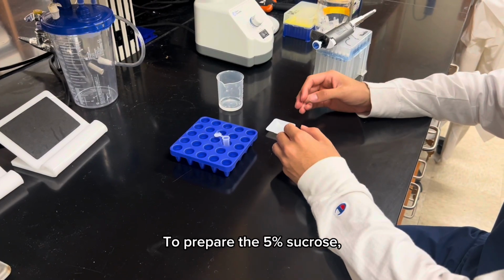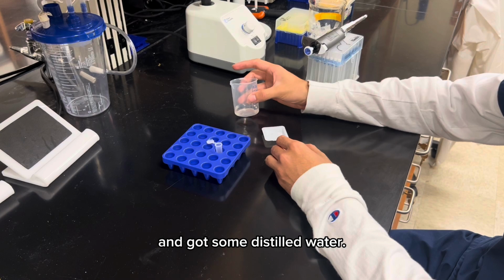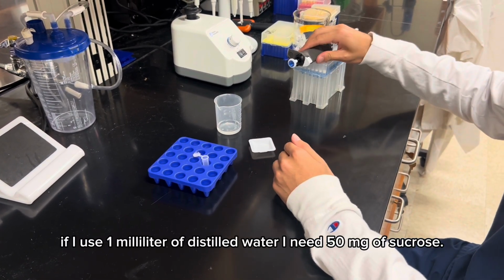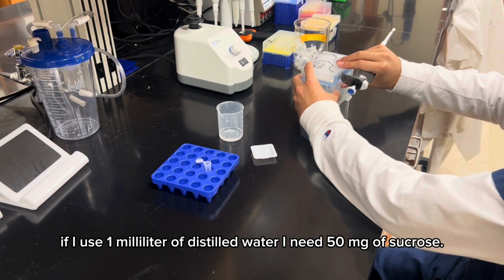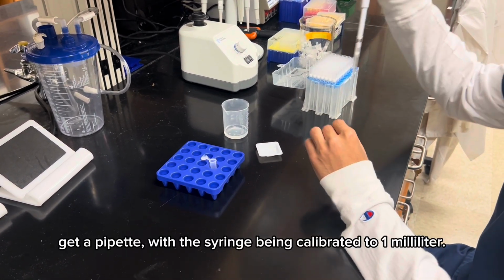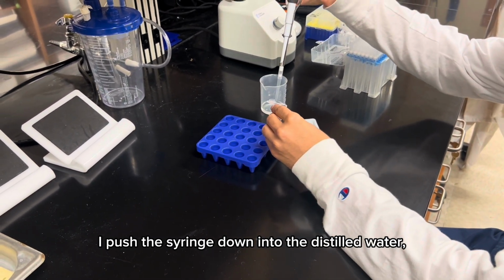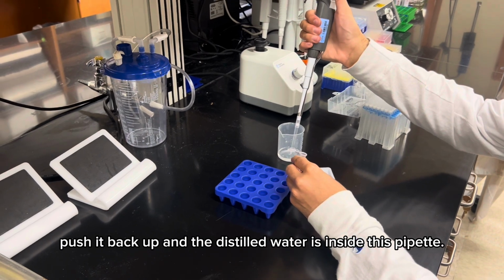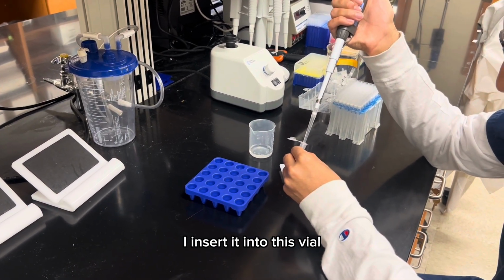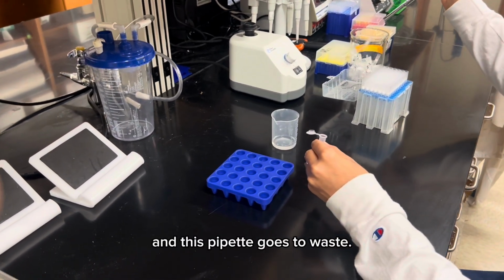To prepare the 5% sucrose, I measured out the sucrose in a weigh boat and got some distilled water. To prepare 5%, if I use 1 milliliter of distilled water, I need 50 milligrams of sucrose. What I do first is use a syringe and a pipette, and this syringe is calibrated to 1 milliliter. I push the syringe down into the distilled water, push it back up, and the distilled water is inside this pipette. I insert it into this vial. So now there's 1 milliliter inside this vial, and this pipette goes to waste.